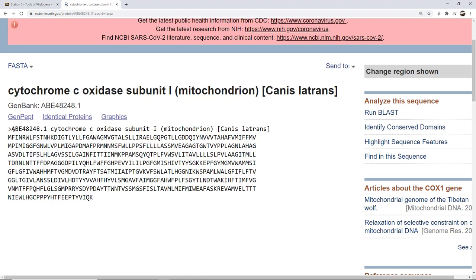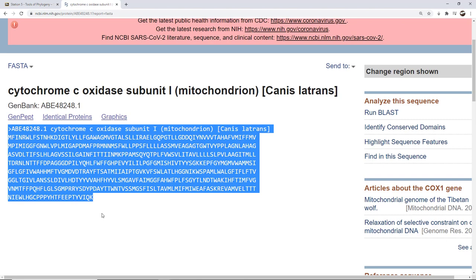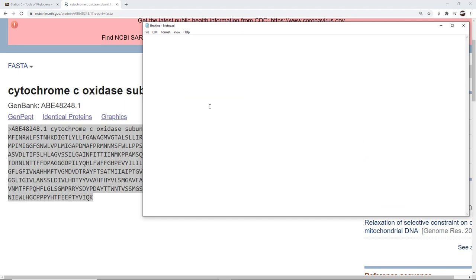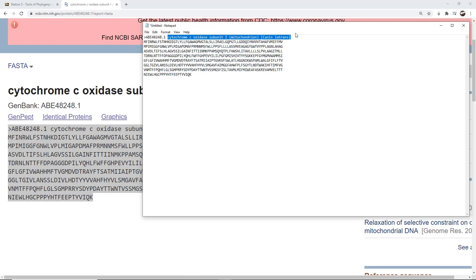What I would do for my analysis is copy this sequence and then paste it into Notepad or whatever program I'm going to use. I'm going to open up Notepad and paste it here. I need to get rid of some of that extra material. I can rename this if I wanted to — I could just name it Canis, but I can't have spaces in the initial labeling, so I'm going to use an underscore: Canis_latrans. Then I'm going to go back and find a second sequence.